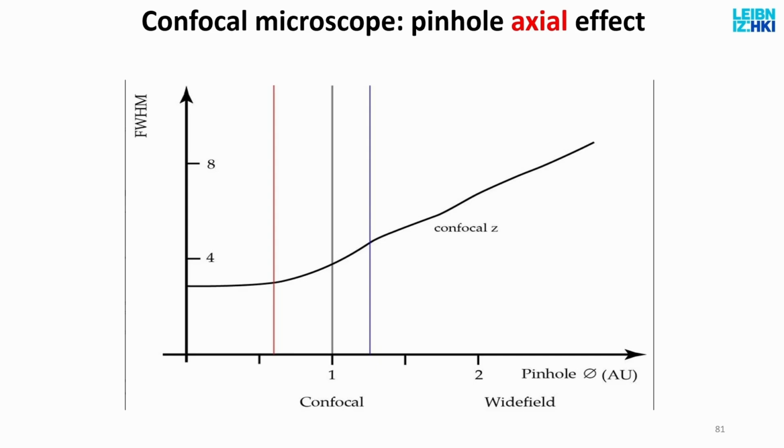The size of the hole in the middle of the donut depends on the energy of the laser that illuminates the donut. And if the energy is too high, you simply kill your sample. So there is a limit. If you illuminate a diamond crystal, which doesn't care about the heat, then you can bring the resolution of the STED microscope to 2 nanometers. So again, in lateral resolution you improve a lot, but in axial resolution you don't improve much unless you combine it with a second donut. But in lateral you get around this.